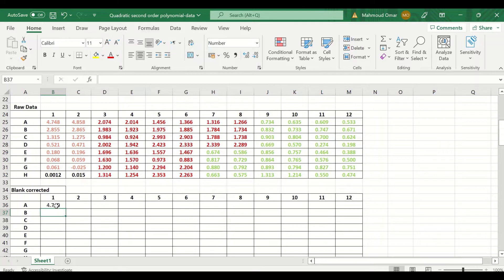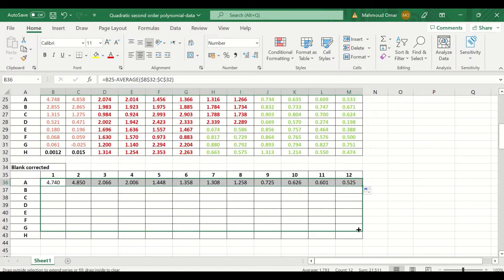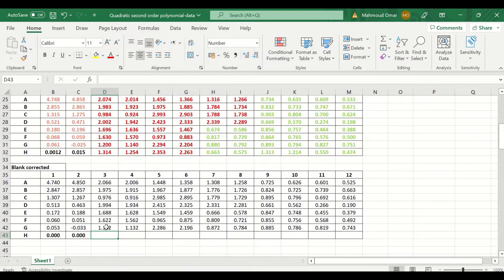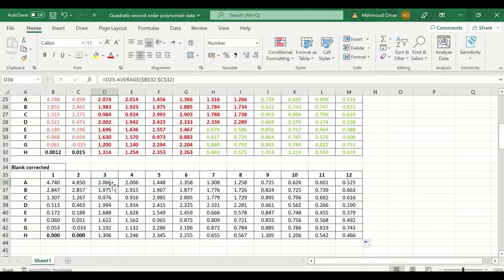A value is generated after blank correction. To auto-fill and auto-calculate the blank corrected values, select, drag, and release for all sample columns. For the water/blank itself, the value is already zeroed. We now have the blank-corrected absorbance values for all samples in duplicate — whether disease, control, or standard.